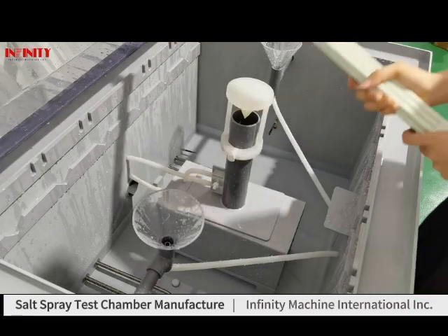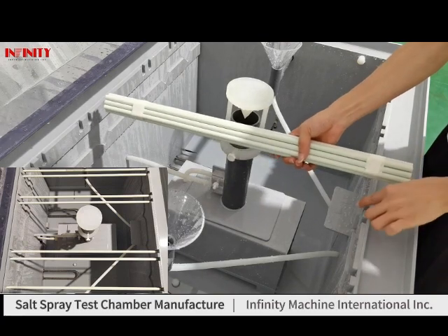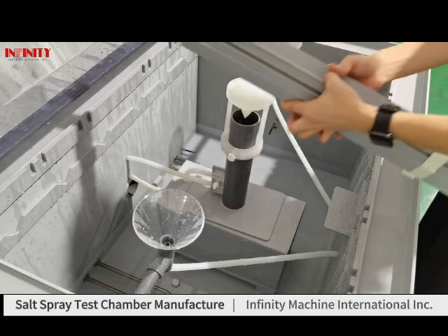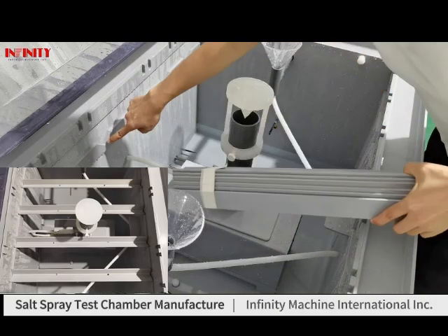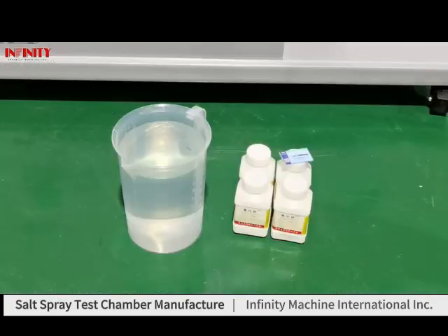We also prepare two types of test sample holders. This is the base holder — one position takes one piece of base. And this is the V-shaped holder — one position takes one piece of this V-shape, which can hold test samples according to testing standards.